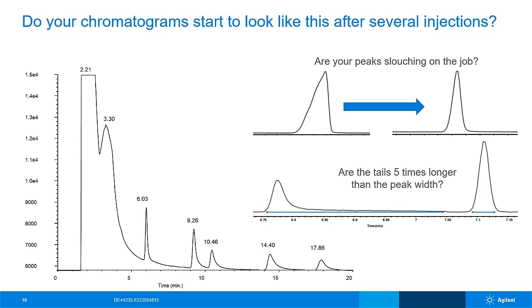But I just wanted you to visualize how the chromatogram looks after a column is not performing as it should be. It's mostly 2 things that are easy to identify. The peak tailing, this is because of the creation of active sites. This is because silanols are now present, maybe due to oxygen.